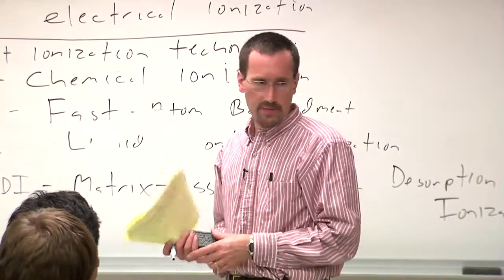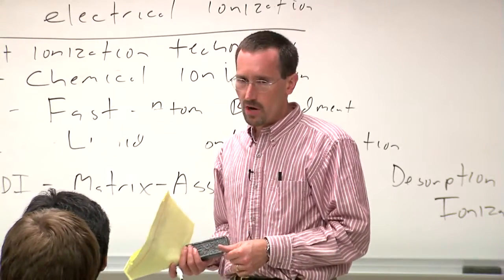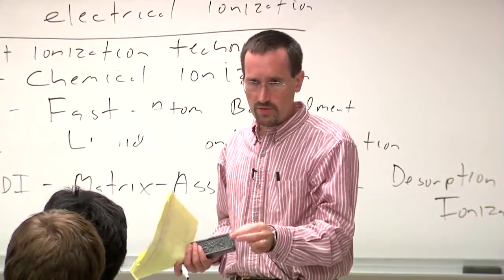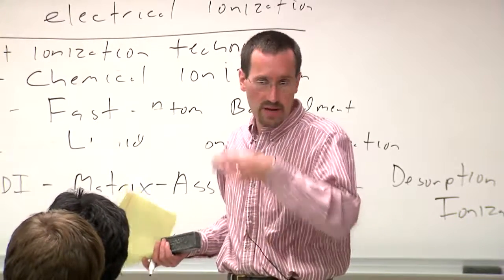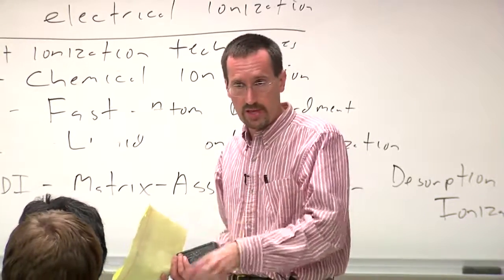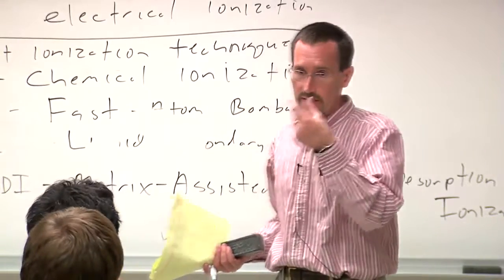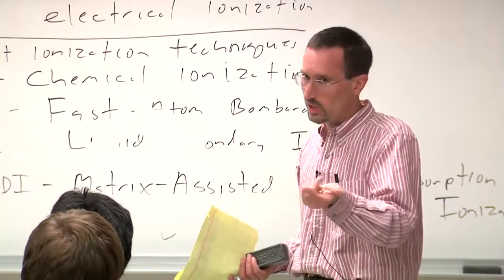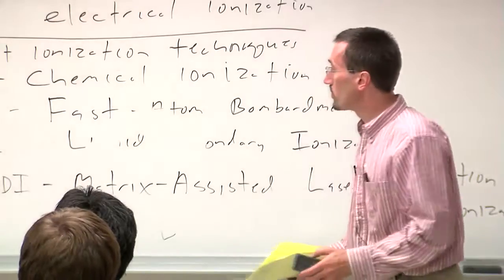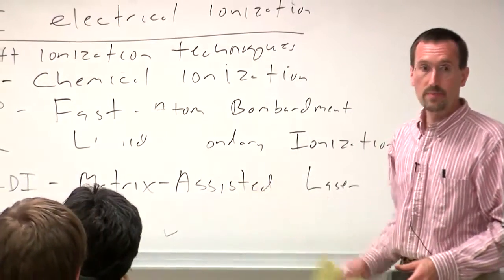In ESI mass spec, which we'll talk about in a moment, because the molecules are actually starting in solution phase, you may ionize a pair of molecules that are already stuck together. So you may, for example, see a molecular ion that's derived from 2 molecules and, let's say, 3 charges. But yeah, you do not typically see polymerization.